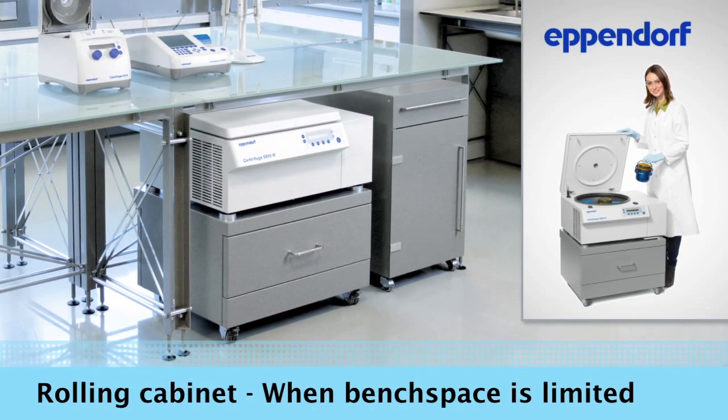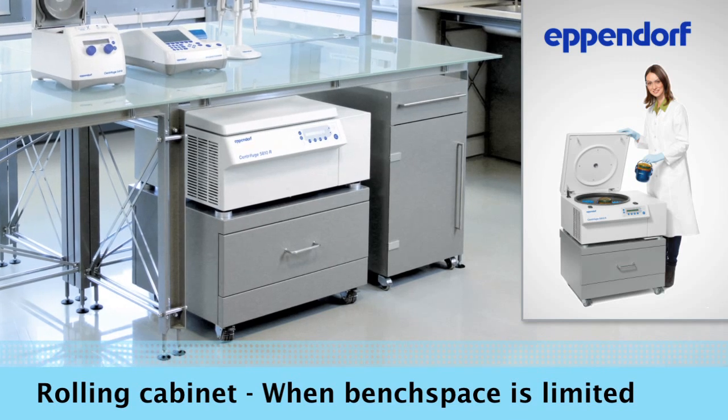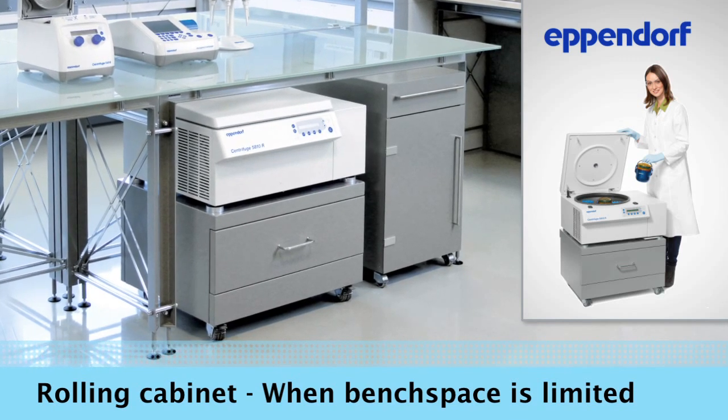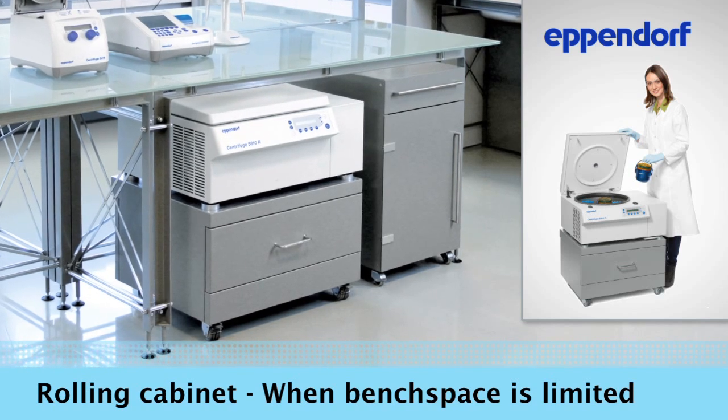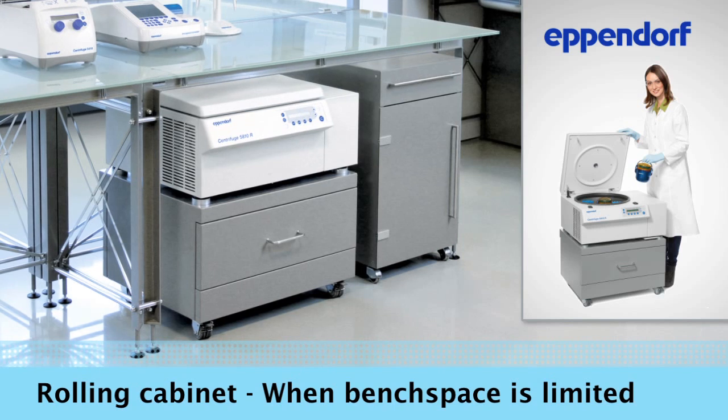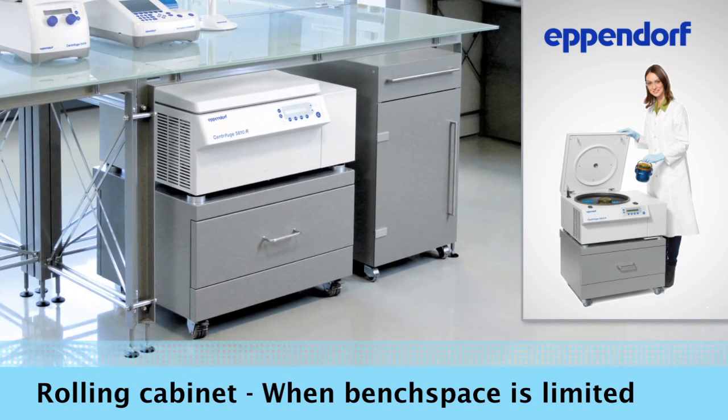If space is a limited resource in your lab, Eppendorf's rolling cabinet can give you the freedom and flexibility to use your centrifuge wherever you need it. Use the rolling cabinet to store the centrifuge under your lab bench or to transport the centrifuge to other labs.